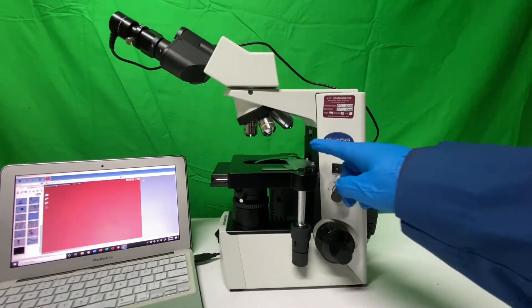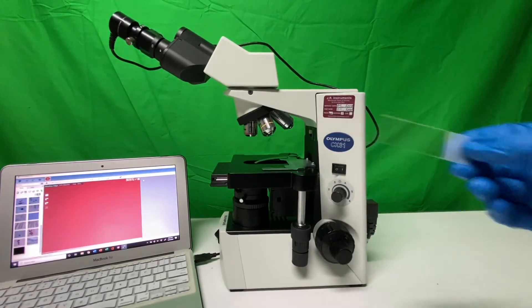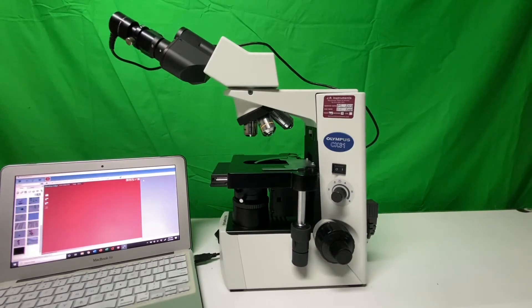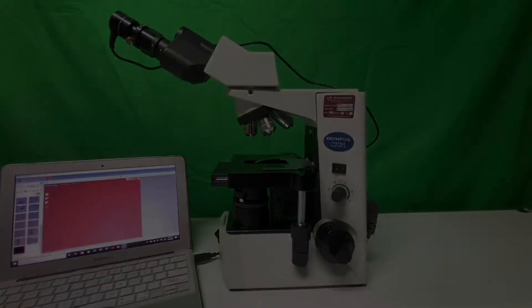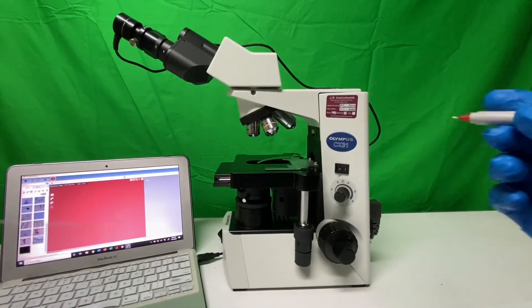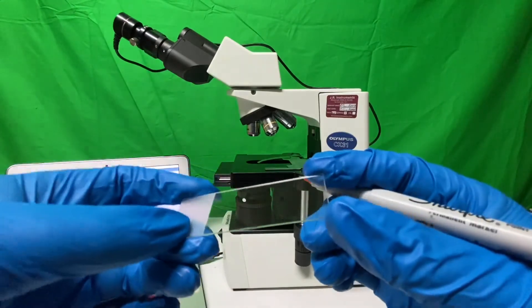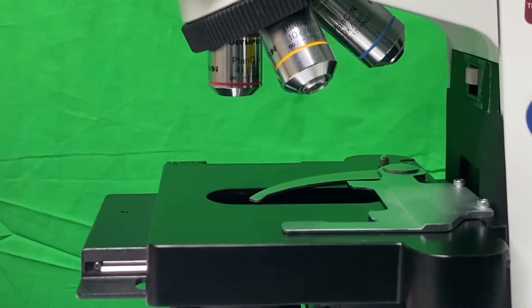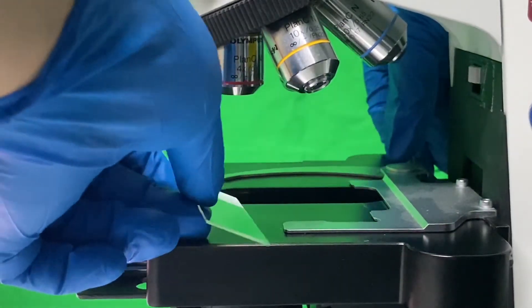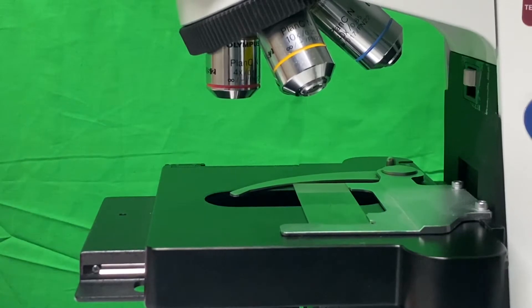The next step is to learn how to load our slide using our stage clip. We've brought some slides and will use them to start focusing and testing everything out. In this case, I'm drawing a plus sign on the slide so we can observe it under the scope. To load the slide, open up the stage clip carefully so you don't chip the slide, gently slide it in, and close the clip back up. You'll now be able to shift the slide back and forth and up and down.